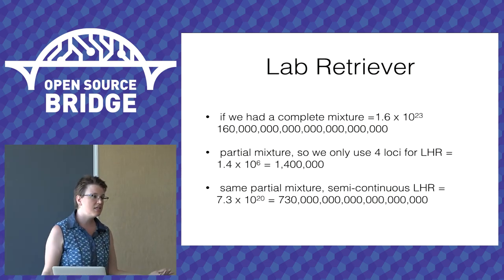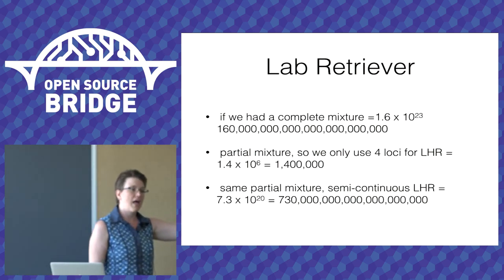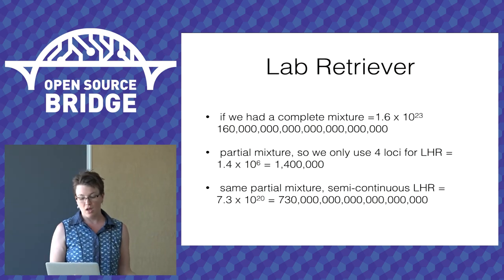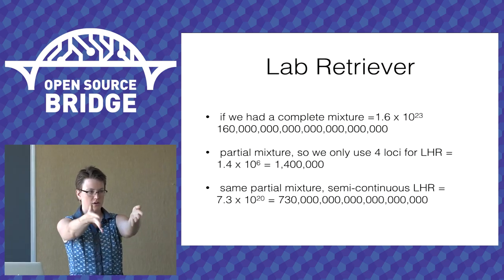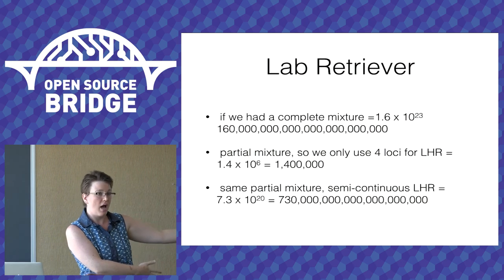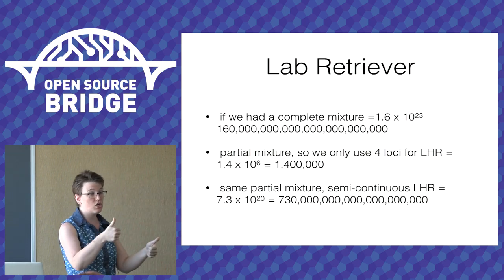I can give the same DNA profile to one of my coworkers. I could give it to somebody else in another lab, and they won't have different rules for how to handle it. They should get the same number. The defense can take my profiles, which they are legally entitled to under a discovery motion. They can give it to any private lab that they want to hire, and they can say, you crunch it, make sure you get the same number. That's good.